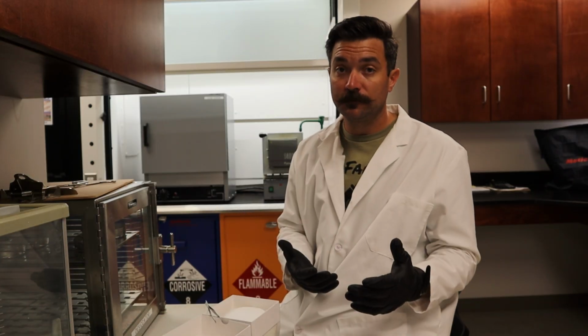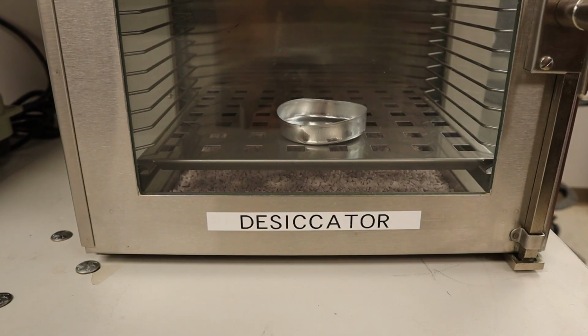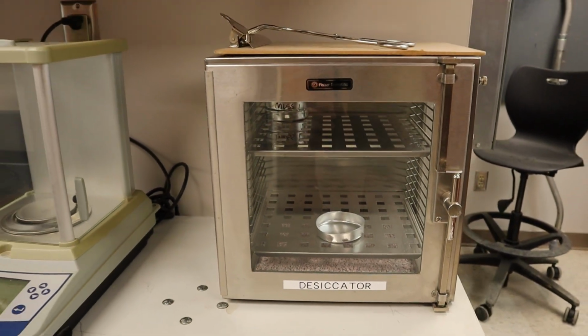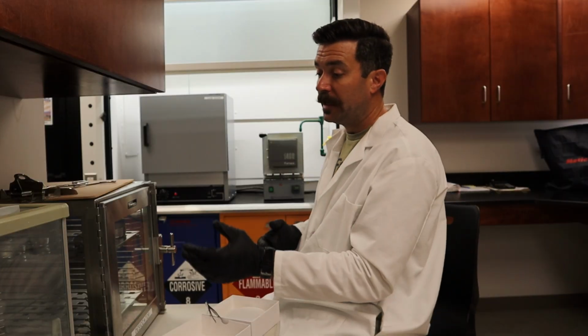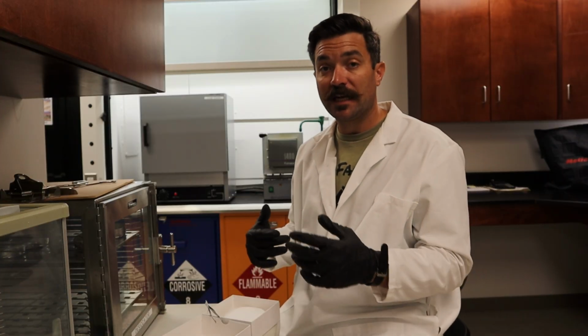After it leaves the lab oven, it's going to come right here to the desiccator. The desiccator is another very important piece of equipment. It allows your samples to cool in a moisture-free environment, and that's what you want. You don't want to just set it out and allow moisture to latch back on, because that's going to give you an inaccurate result.